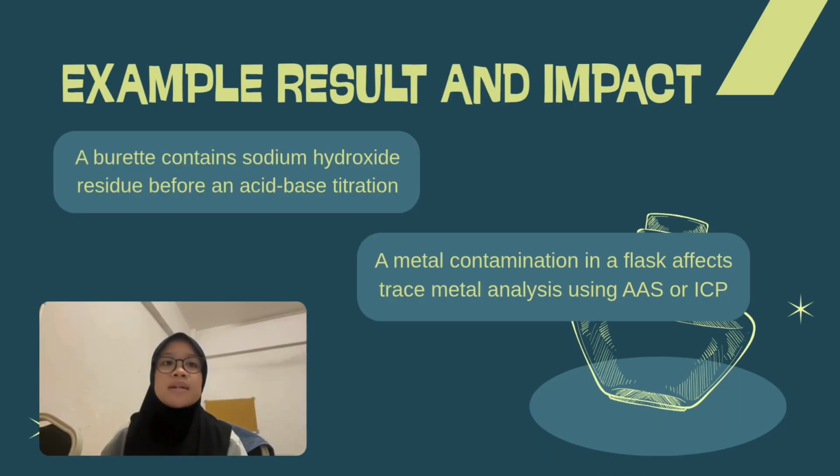So here are some examples of how improper cleaning can affect the analytical results. Imagine a burette that still contains a small amount of sodium hydroxide from a previous experiment. It is later used for acid-base titration. Without proper cleaning, the remaining sodium hydroxide will react with the acid, causing the measured concentration to be inaccurate and leading to an incorrect endpoint.